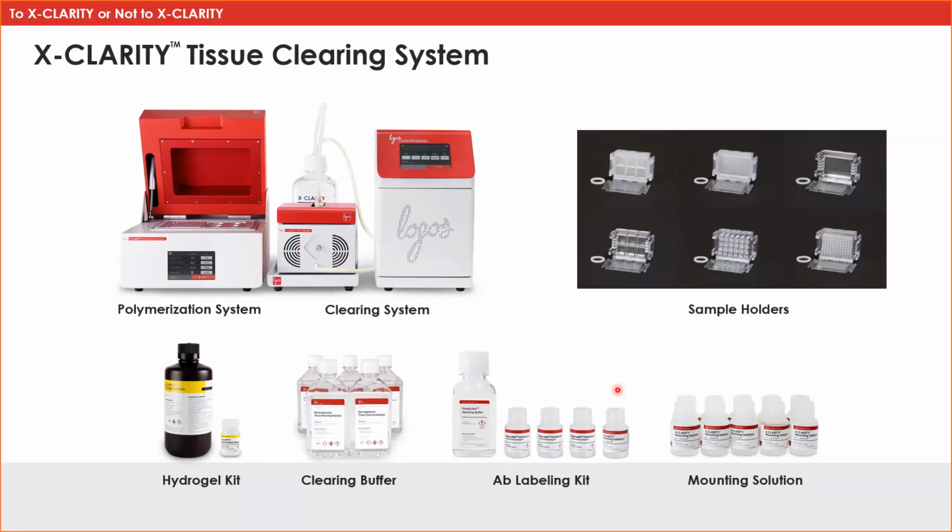The X-Clarity tissue clearing system is comprised of these two components right here. This is the clearing chamber where your actual sample goes. This is the control tower right here. In the back, it may not show up on the white background so much, is the buffer reservoir where you put the SDS buffer. And you have tubes that are connected to the clearing chamber and also to the built-in peristaltic pump within here.